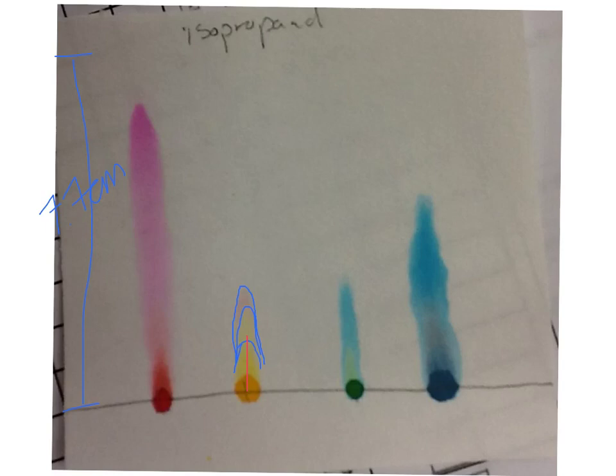And then we are also going to measure from the middle of this to the middle of the red mark as well. So let's say this first one, the yellow one, was like 1.4 centimeters. So in order to get our RF value, we'd say 1.4 centimeters over 7.7 centimeters. And these units cancel out, and so we'd have our RF value for the yellow part.